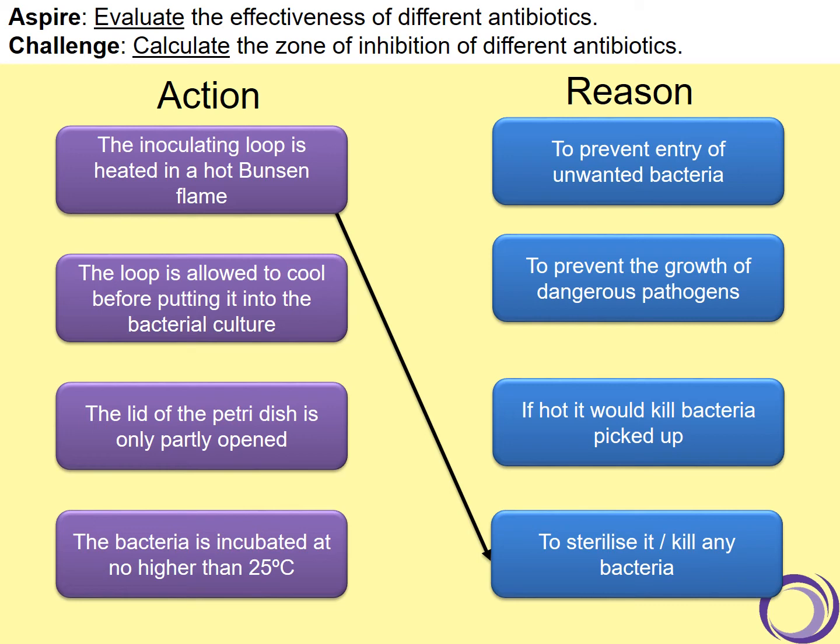The loop is allowed to cool before putting it into the bacteria, because if it's too hot, then obviously it would actually kill the bacteria.